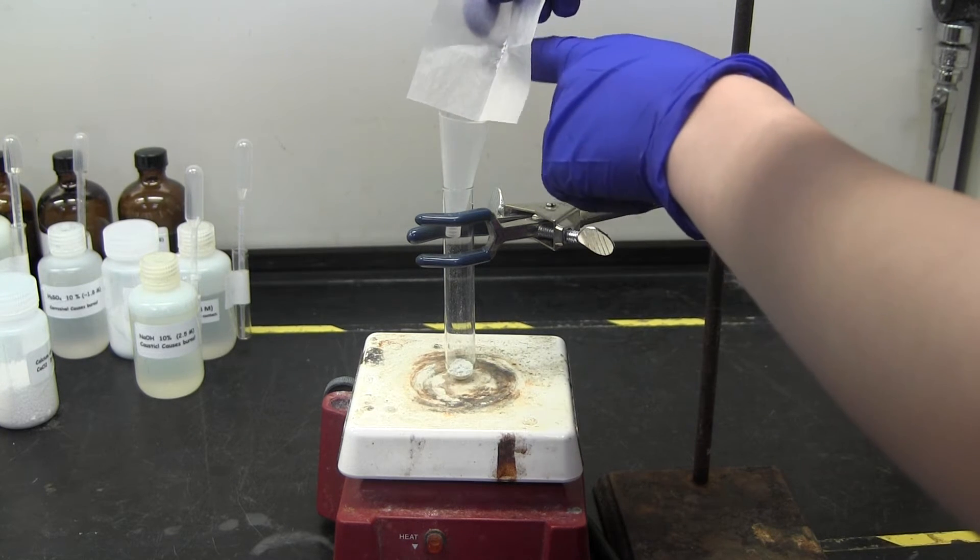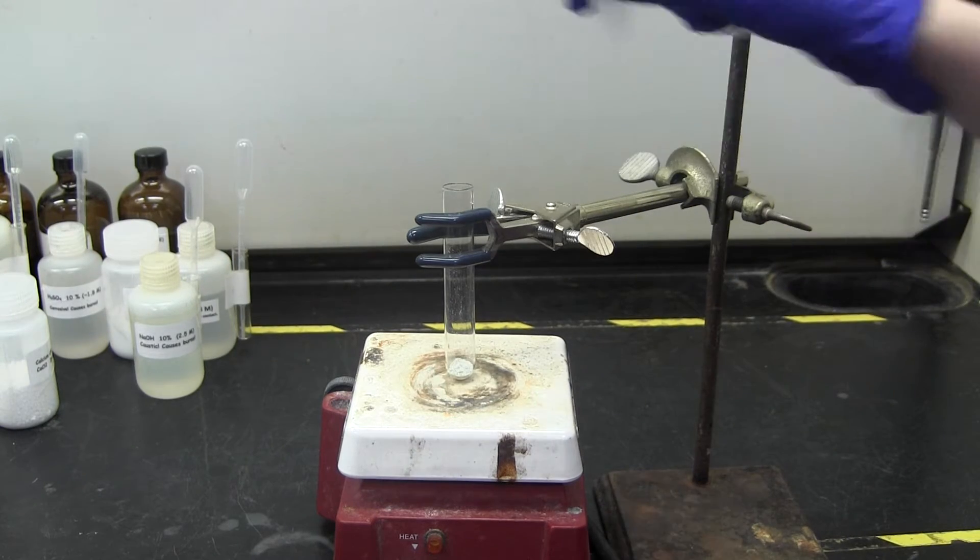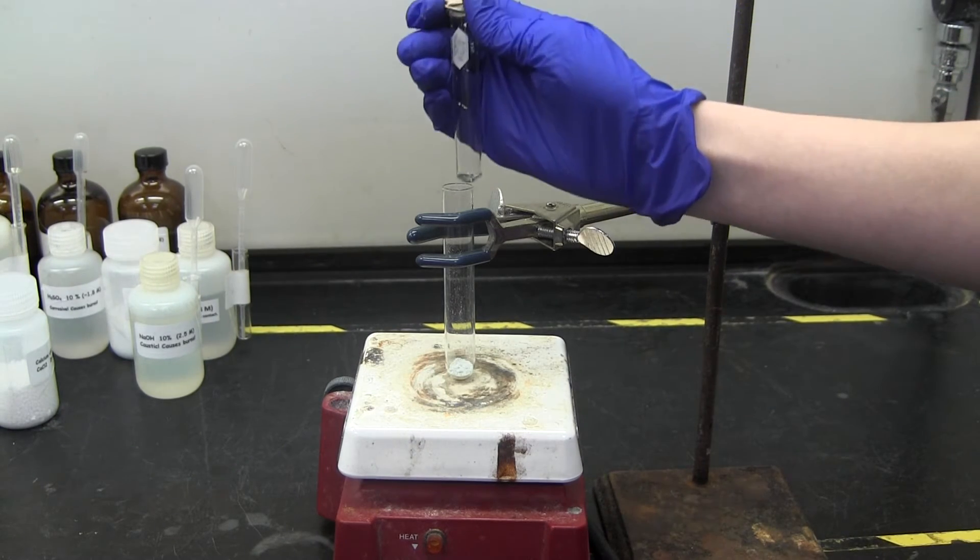To start the purification, you will put your unknown in the large test tube. You will then fit the small test tube inside the large one with the same placement as before.